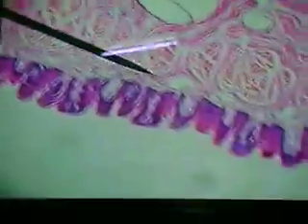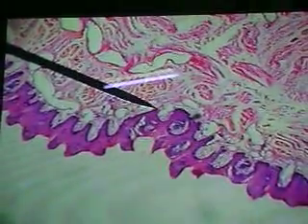We're going on to here. Alright, and maybe coming towards the tip. And some odd looking filiform papillae. Mainly, this is very close to the tip of the tongue. See all these sharp looking, sort of conical structures, they look like fir trees. These are the filiform papillae. So sadly, so far no good ones.